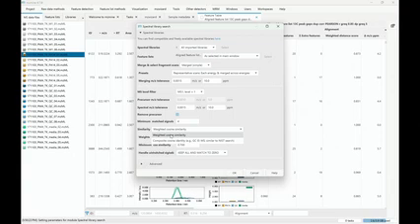We do add more and more methods, and we are very interested in the community reaching out to propose methods to us. There's a great paper, maybe there's even an implementation already, and then just define what is the input, what is the output, and maybe how we can link it up to other things to make it more valuable than just having, let's say, an output to a Python module.